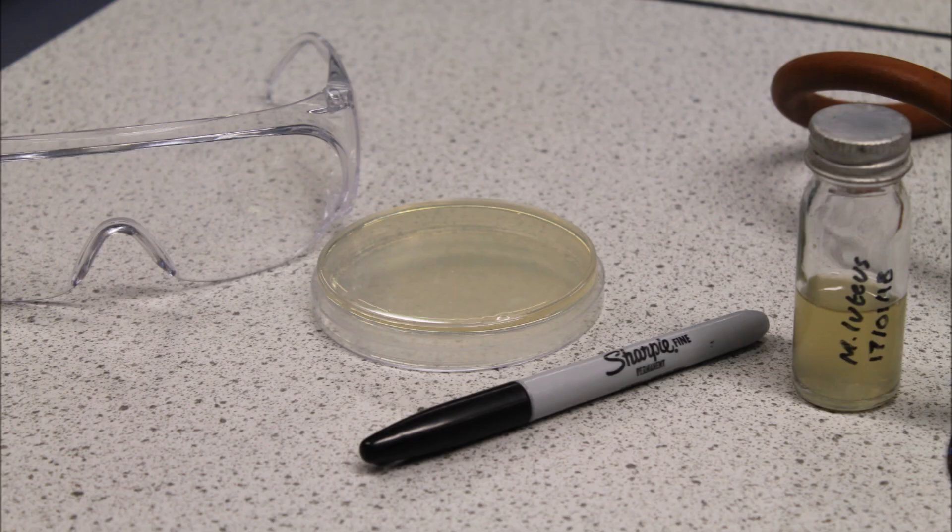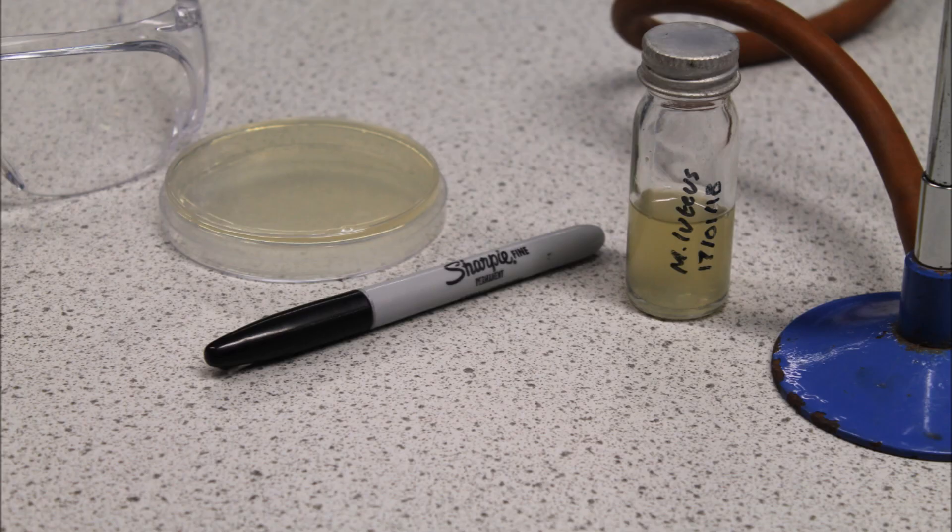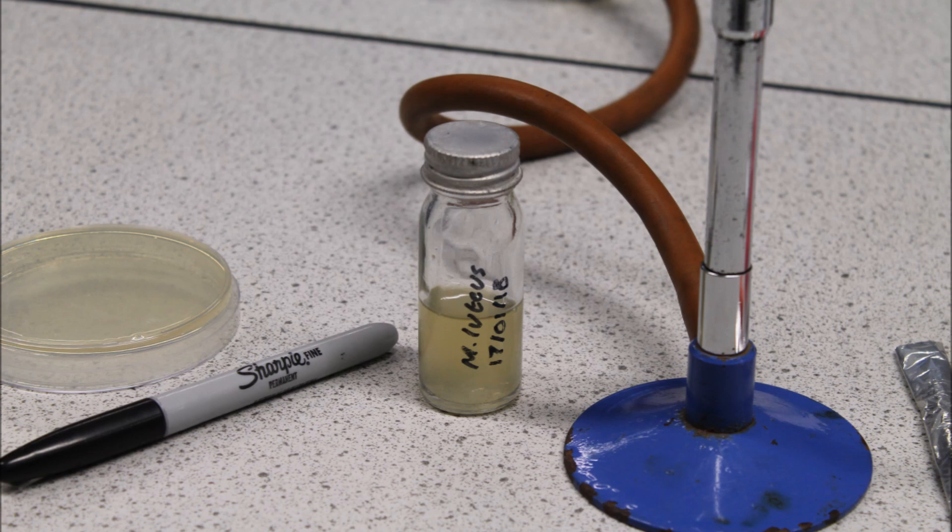Eye protection, a sterile agar plate (that is to say a plate which has been treated at high temperature and pressure so it is completely clean and free of microorganisms), a marker pen, and a bacterial culture. Here we have a culture of Micrococcus luteus.